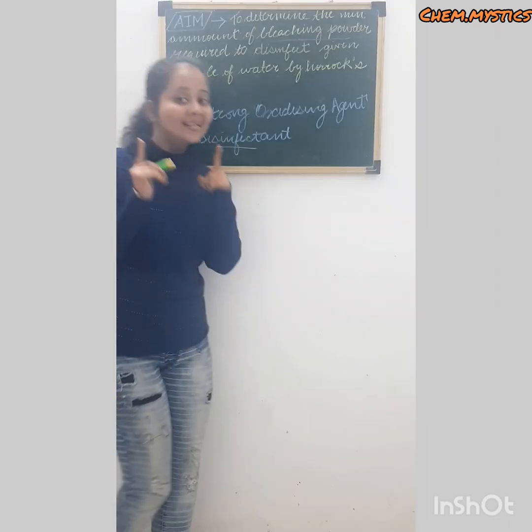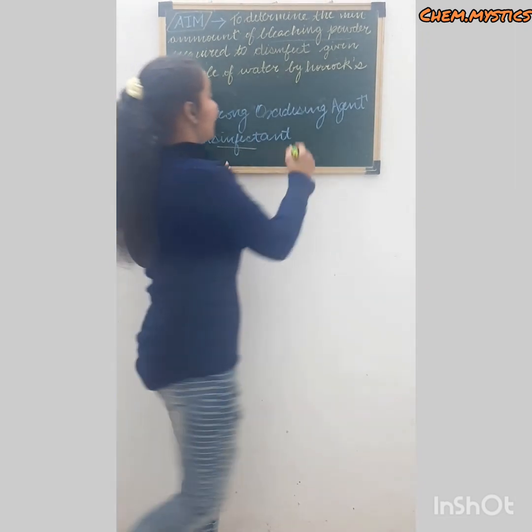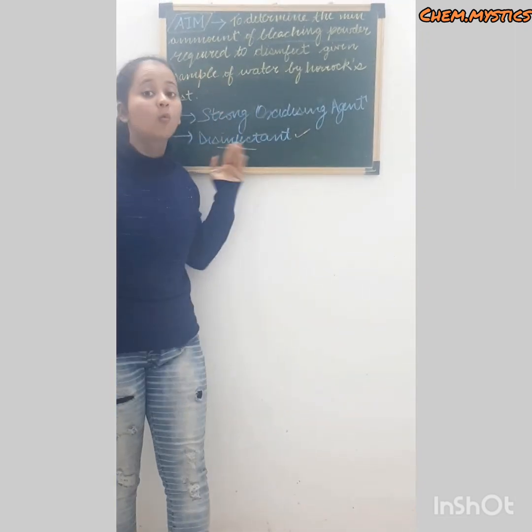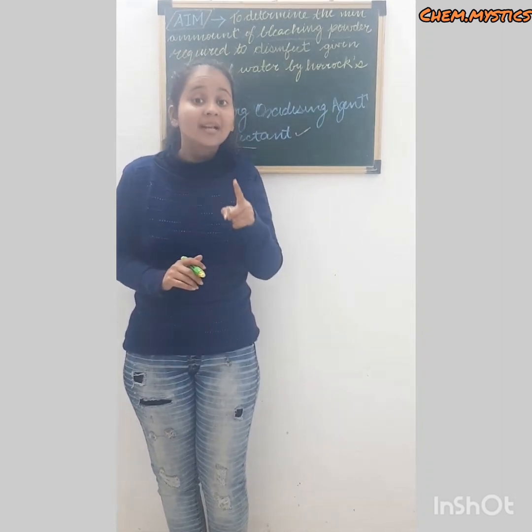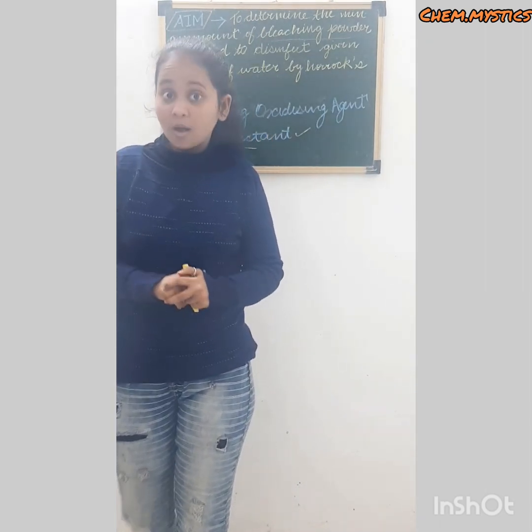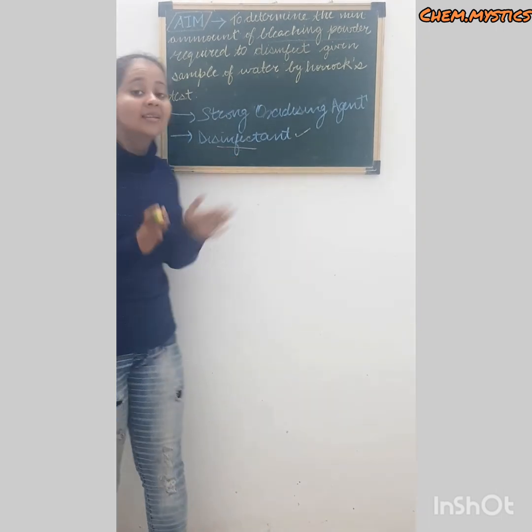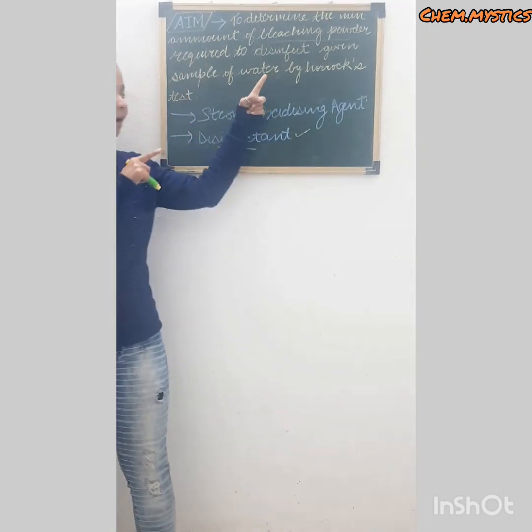Listen carefully, guys. A disinfectant is a substance that kills germs like viruses, bacteria and other microorganisms that can cause infection or disease to living organisms. If I talk about a good example of a disinfectant, then that is nothing but the bleaching powder.